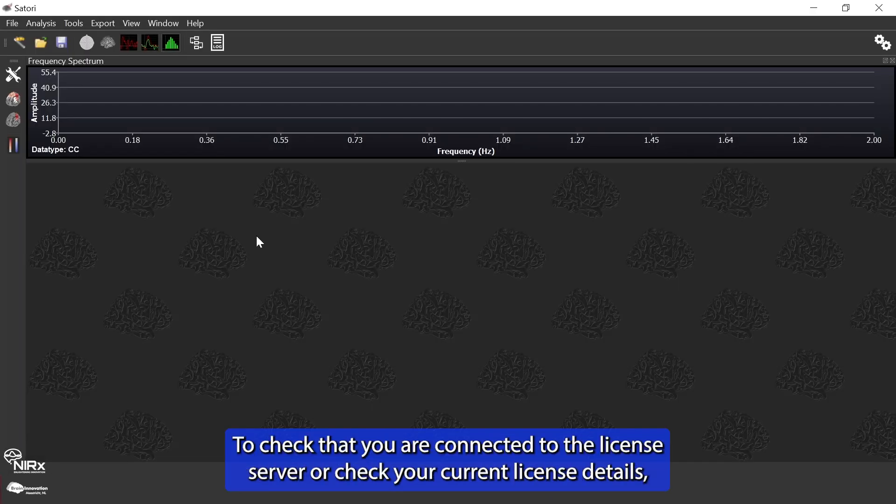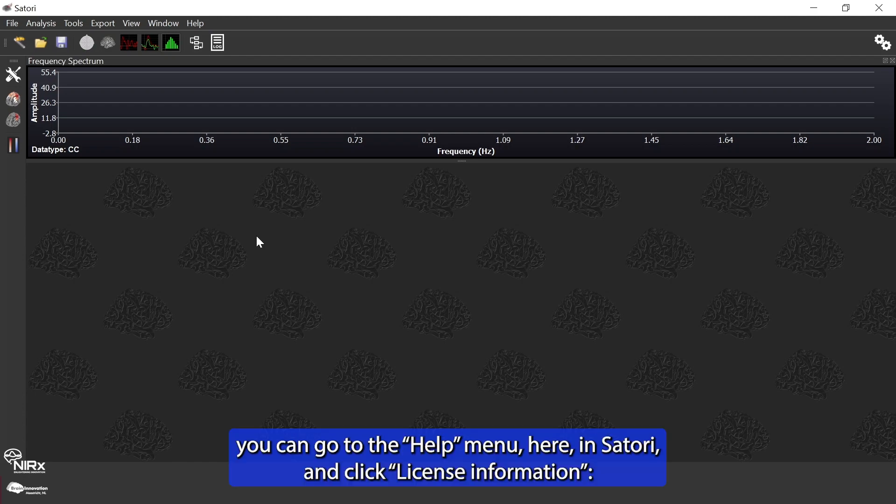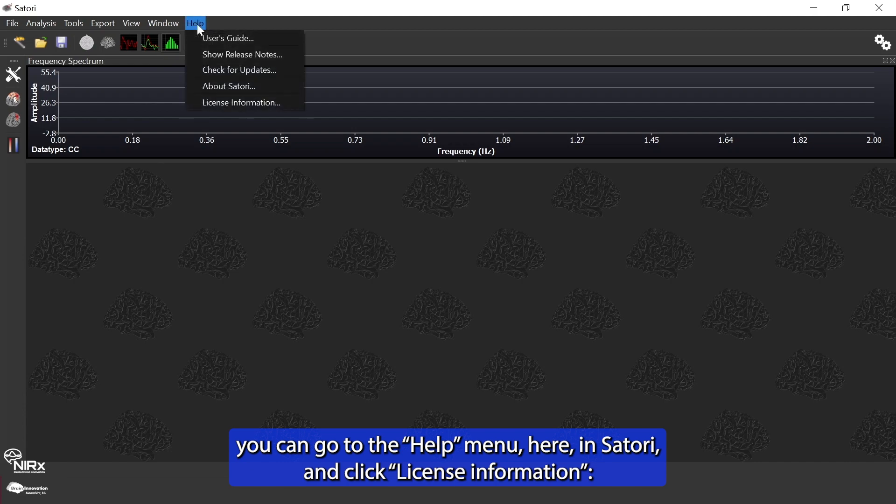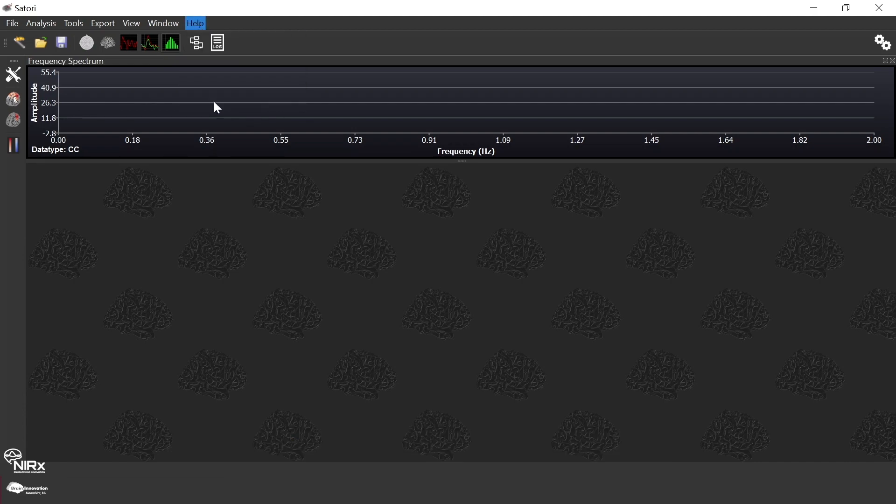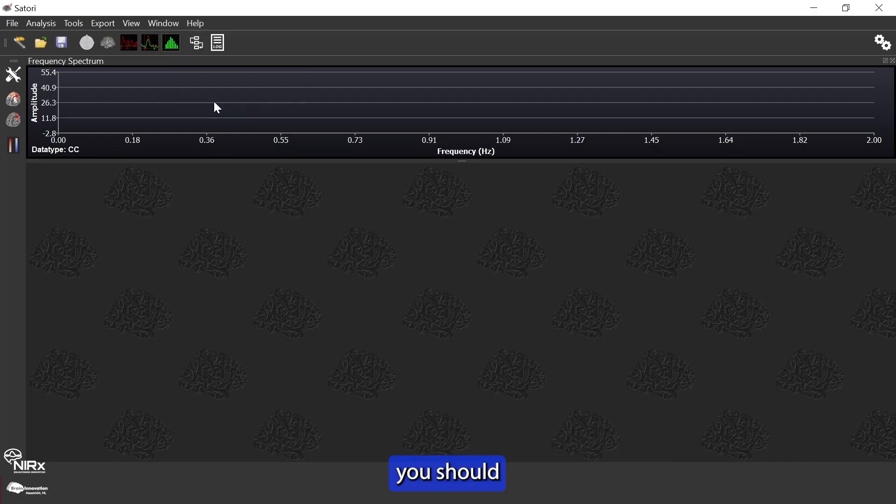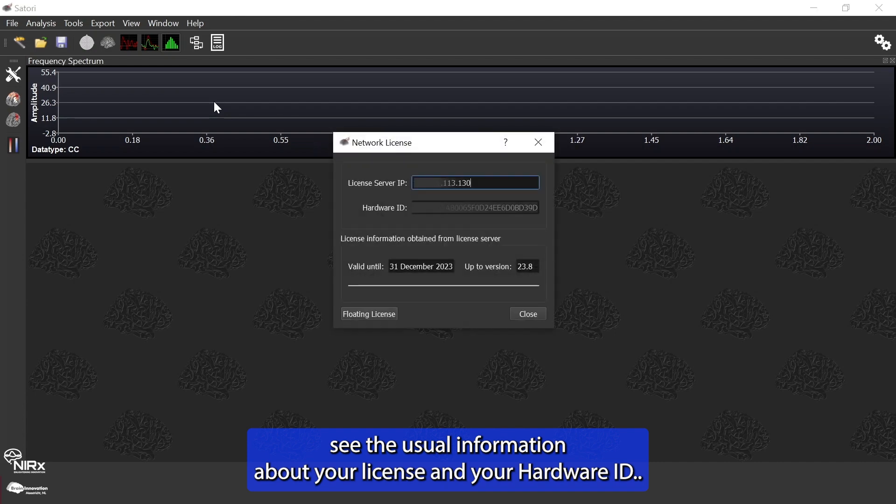To check that you are connected to the license server or check your current license details, you can go to the help menu here in Satori and click license information. You should see the usual information about your license and your hardware ID.